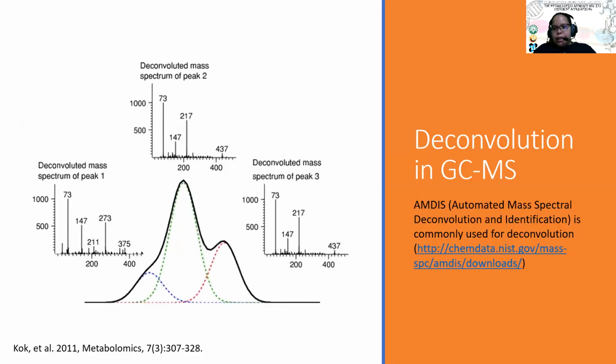Again, as I mentioned, the processing for GCMS data is a bit different. Kasi, di ba, GCMS data with electron ionization, you get fragments right from the start. So, after it has been ionized, nafa-fragment na siya, and that is what goes through to your MS.